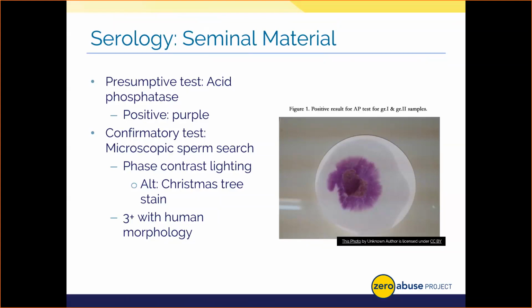Now, I wish AP testing results were as simple as you can see on your screen, but a lot of times they're not. Sometimes weak positives, which is a pink coloration, have been known to occur with certain samples. Now, some analysts will call this a slight color change versus a true positive result. And some labs handle these differently. Personally, I would go ahead and test the samples with a confirmatory test since we can't rule out the presence of semen. But some labs have strict policies where they only process samples that have that purple coloration. And as such, any kind of slight color change results may not move forward with that lab.